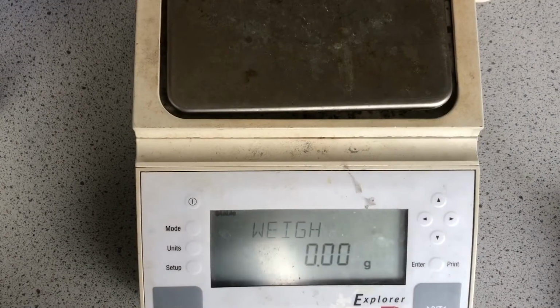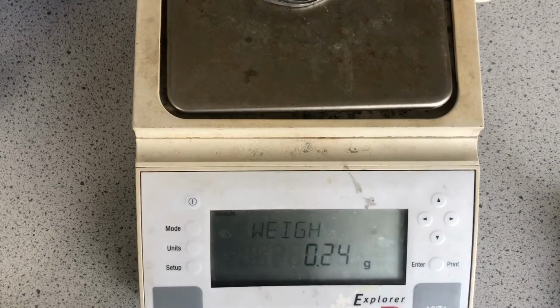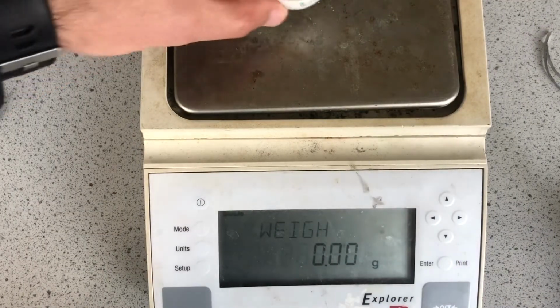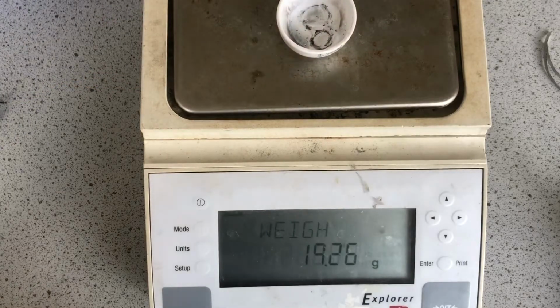So the first thing we need to do is weigh some magnesium and put that into our results table. So there's our magnesium, 0.24 grams. Next we need the mass of our crucible. This is our crucible we're going to use here. I really should use a lid as well, but I just need to get this done quite quickly today, so it's not going to be as accurate as it should be. 19.26 grams, and we'll write that in our table as well.